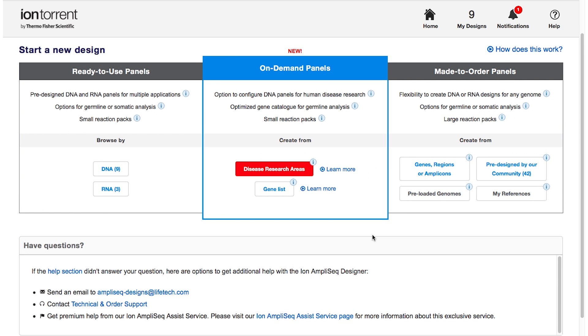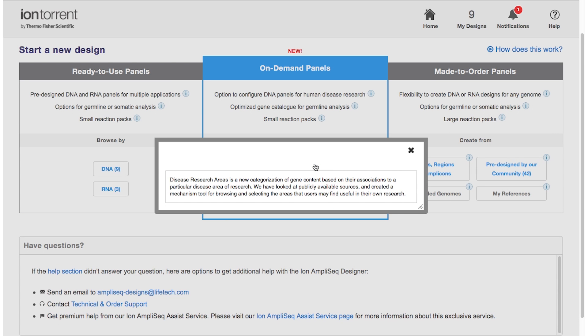We've created resources to help you navigate through each of these workflows. When you're in AmpliSeq Designer, be sure to click the information buttons that are placed throughout the software for helpful tips and explanations.